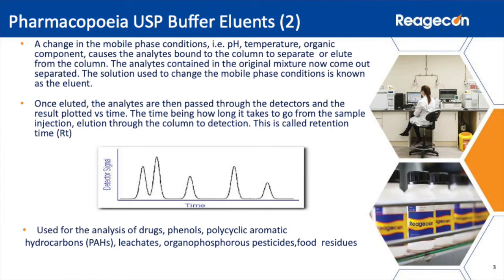Analytes are released from the column by running a solvent or eluent through the column. The eluent is selected based on its ability to either pass an analyte which remains in the bonded phase or displace selected analytes, known as elution, by binding to the bonded phase in its place. Once displaced, the analyte is carried out of the column into a detector for analysis.